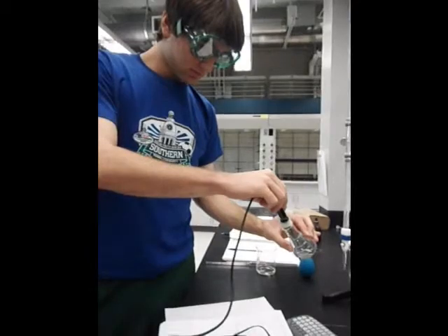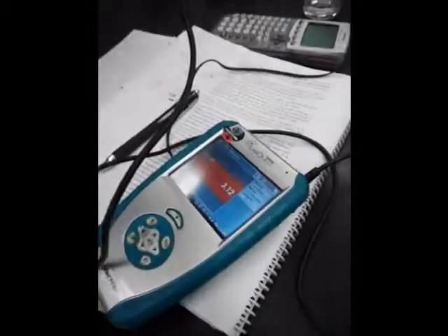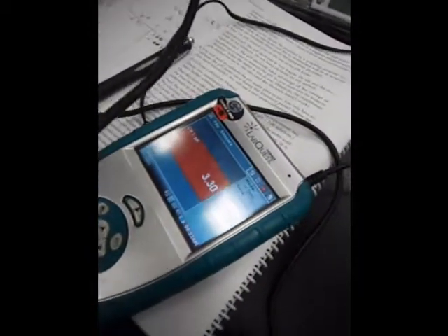At this point in the lab, you no longer need to wash the calibration meter after each trial because you're measuring the pH of the same solution.